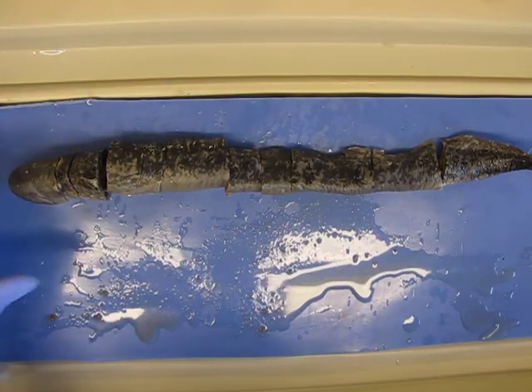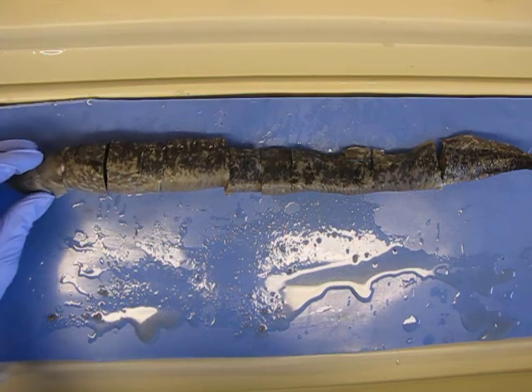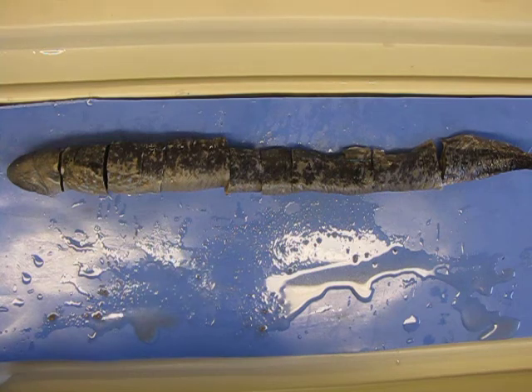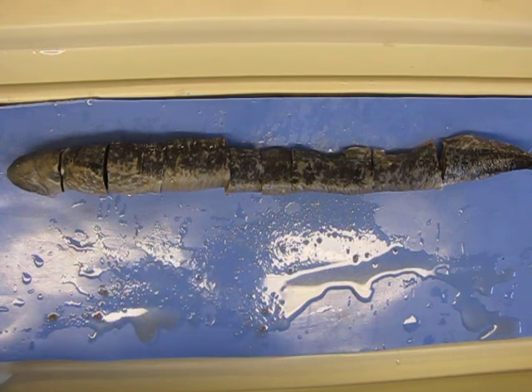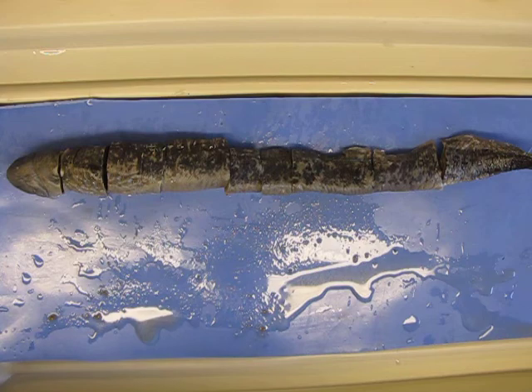Okay, lamprey, transverse sections. Hopefully you've already done the sagittal section. It doesn't really matter what order you go in though, but sometimes it'll be easier if you do the sagittal section on your own specimen first so that you can learn to identify the structures there and then transfer that knowledge here to the transverse sections.